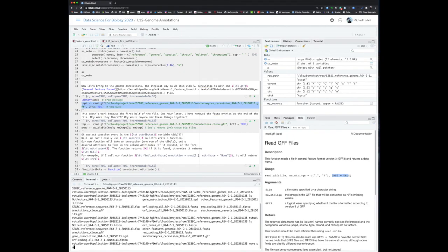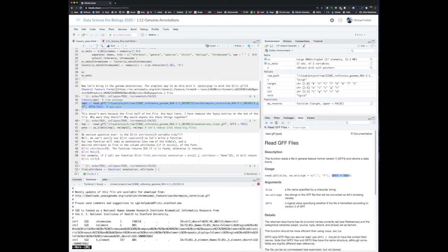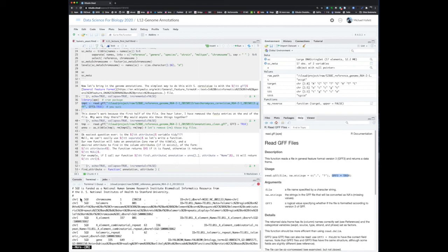So if I just do a more on this Saccharomyces, this is the GFF file now. When I look at that, you can see that basically it's a pretty simple file. It tells you different features along the chromosome. So here we start at chromosome 1, written in a Roman numeral. SGD chromosome 1, that's a bit better. And this is a position. It goes from 1 to position 230,000. And actually, this entry in the file is basically just saying an event is the entire chromosome. It's sort of like just the whole thing. And it gives you some information in terrible format about that.